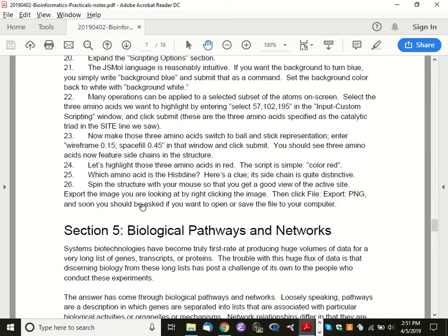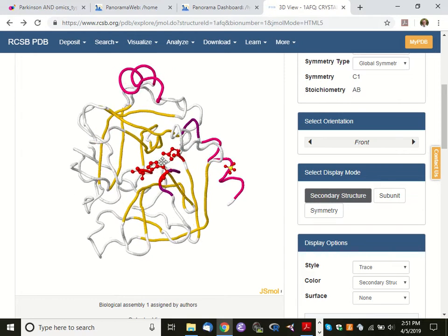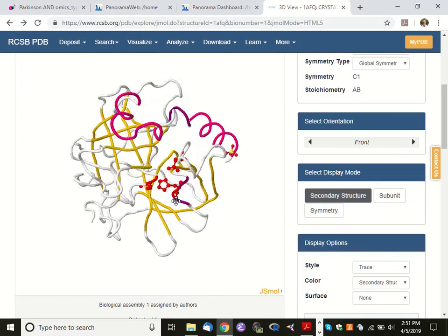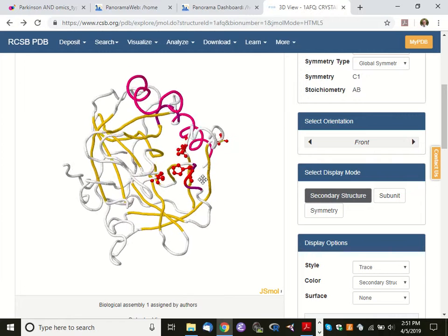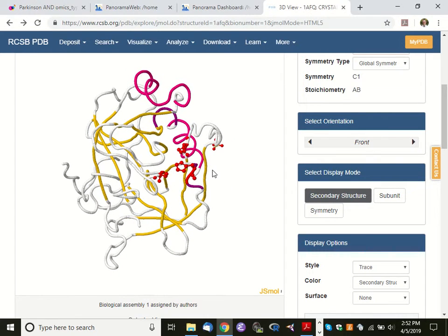Okay. So now you must show your own artistic sense because you're going to position this subject so you can take a snapshot of it. I think something like, this one's tough. Maybe about like that will be good.